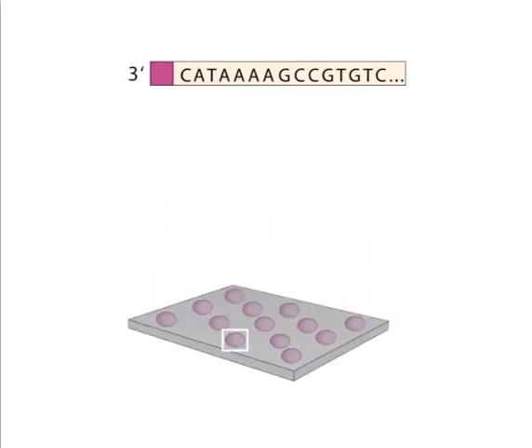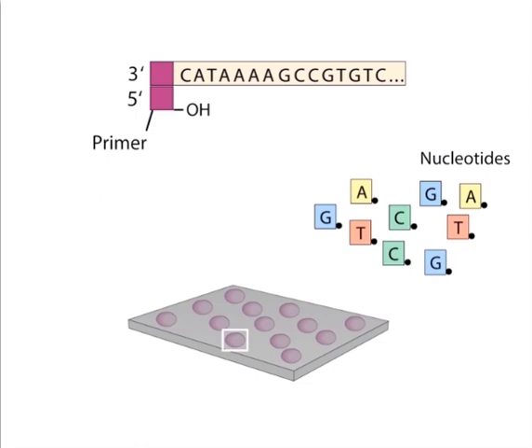DNA sequencing begins with annealing a primer to the template. The primer is complementary in sequence to the adapter DNA near the 3' end of the template. The primers provide a 3' hydroxyl group onto which DNA polymerase can begin to add nucleotides. The four types of nucleotides have fluorescently labeled groups that can distinguish them.